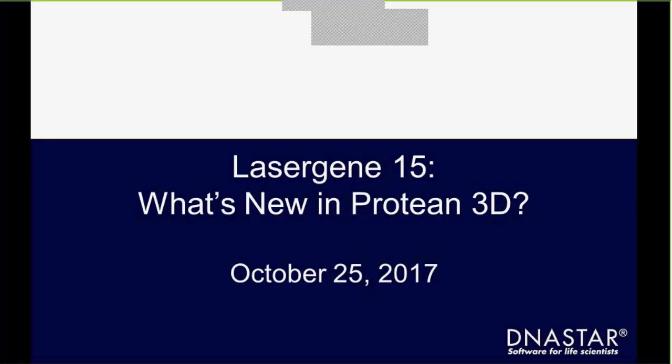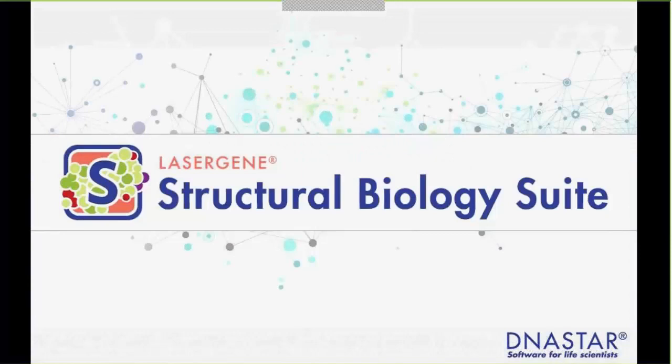I am a principal scientist here at DNASTAR, and I am the team lead of the structural biology group here. We've been working hard over the past 6-8 months to bring the new features released in Lasergene 15 to the structural biology suite. As you may already know, DNASTAR has 3 main product areas that we focus in: molecular biology, genomics, and structural biology, and that's what my team and I work in.